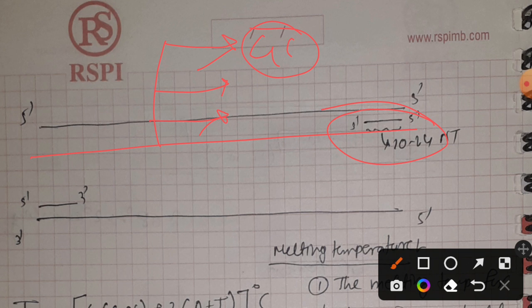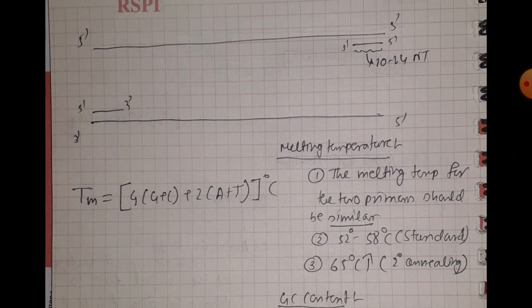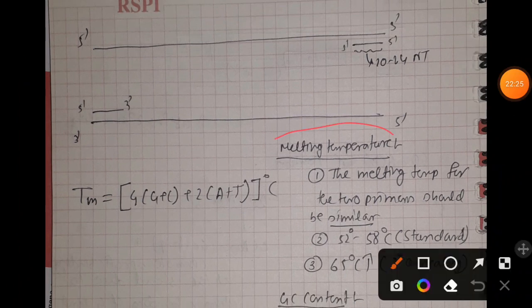Okay, second, they can fail the uniqueness, and third, there can be repetitive structure that can promote self complementarity. Clear? Second important thing, why we are not using low TM value. So low TM value is not recommended because low TM value in turn affects the annealing temperature, and as a result annealing temperature will be lowered and they will promote mismatch priming.